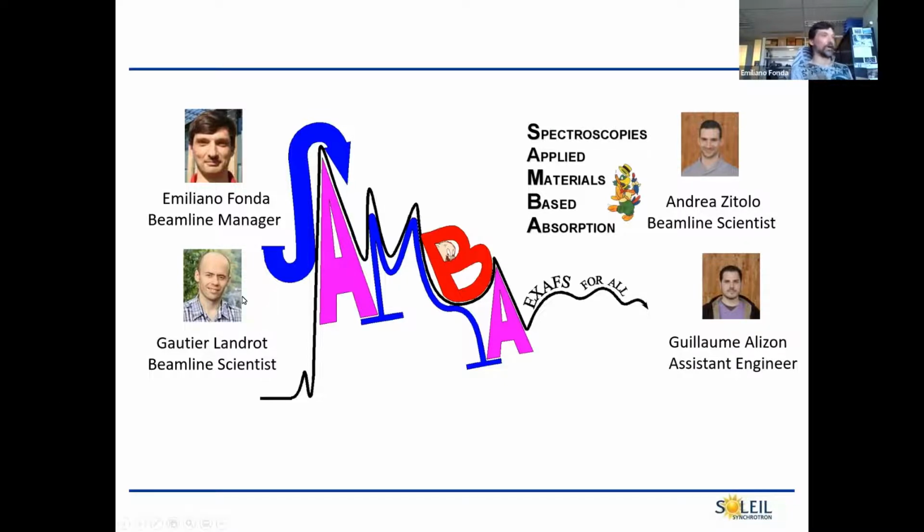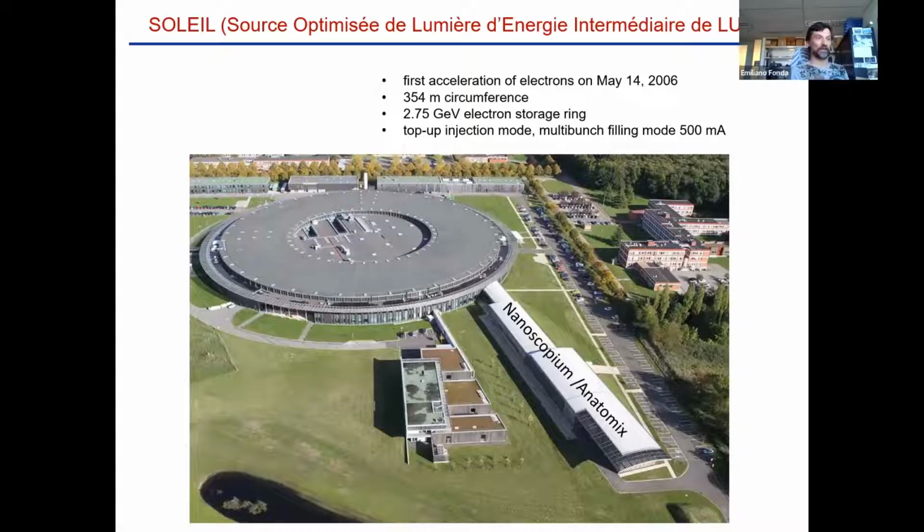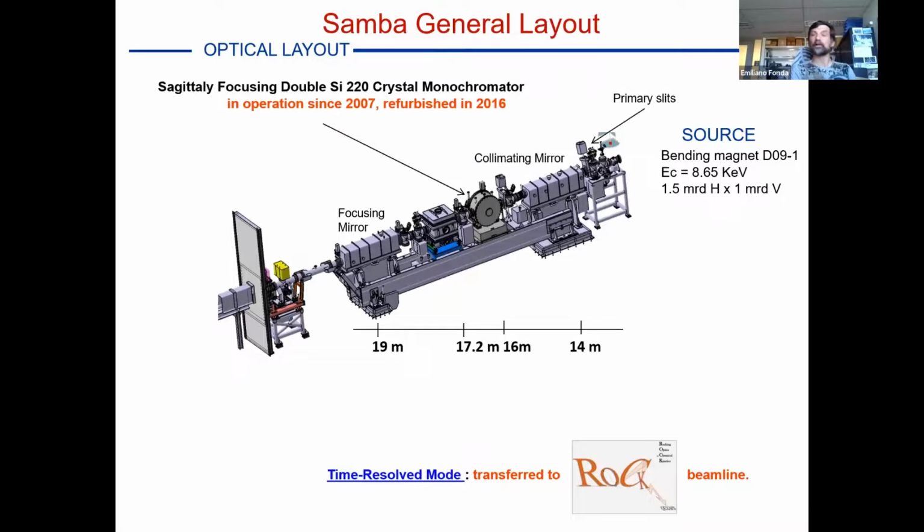So, we are installed on synchrotron SOLEIL, as you said. We are operating at 500 milliamperes in top-up mode from the beginning, and it's a long time, we started in 2006. We were younger, as you notice in the pictures, and the top-up mode ensures us really good stability. We are on the bending magnet beamline.